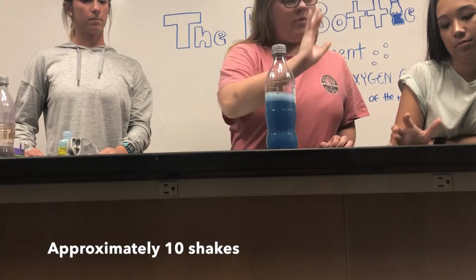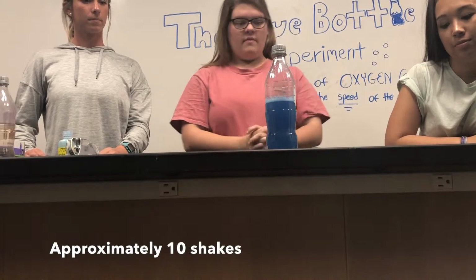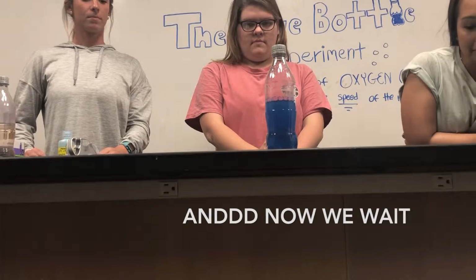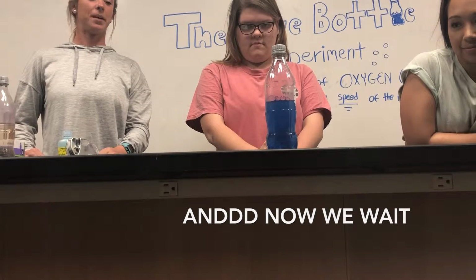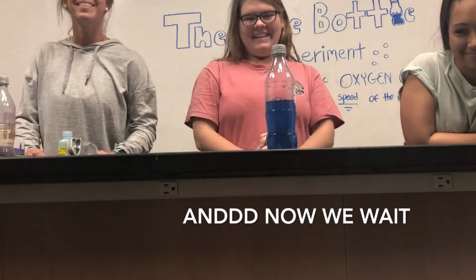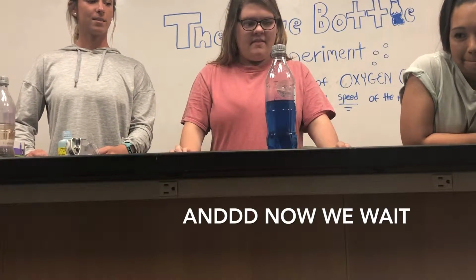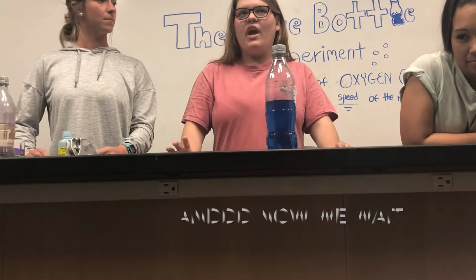So it's blue one more time, and we're going to start the timer. That's about the amount of times I've been shaking it.